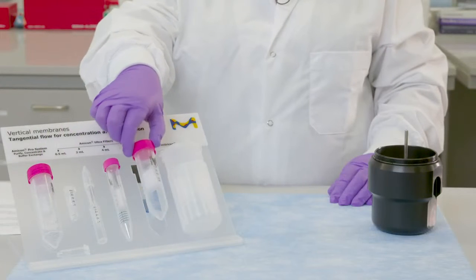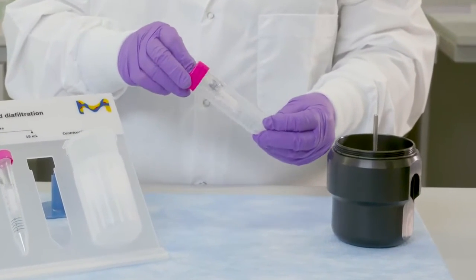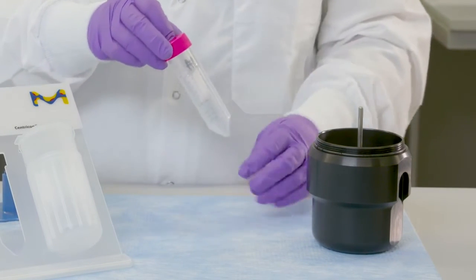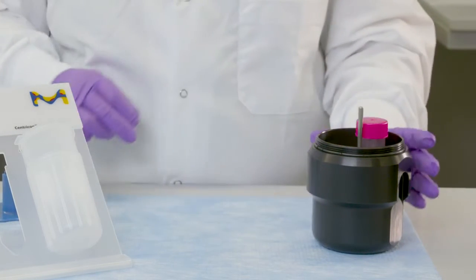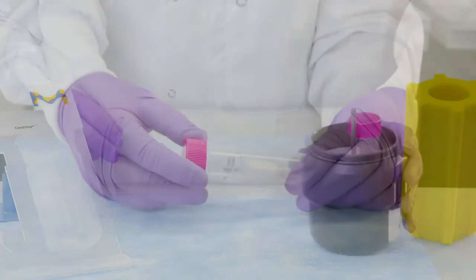The Amicon Ultra 15 uses a centrifuge with swinging bucket rotor or fixed angle rotor with wells and carriers that can accommodate 50 mil tubes. For the Amicon Ultra 15, use a reduced volume when using fixed angle rotor to avoid leakage through the cap.